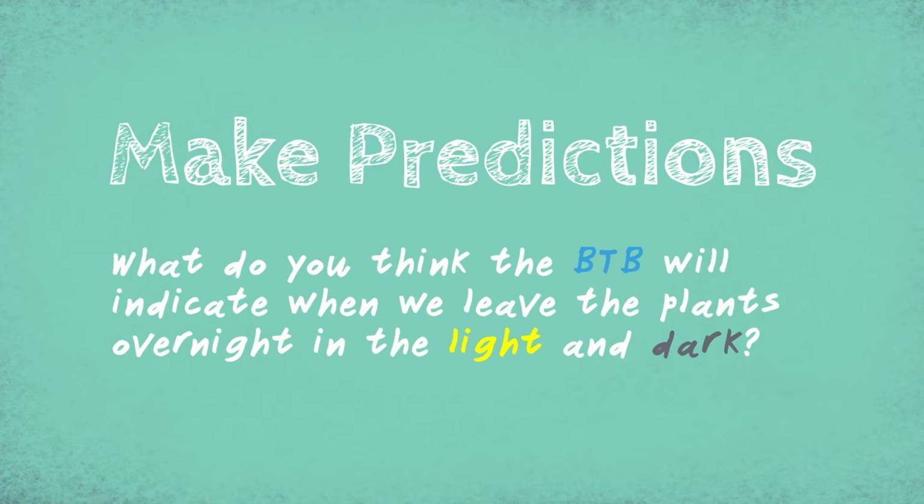What do you think the BTB will indicate when we leave the plants overnight in the light and dark? Let's pause now while you make predictions about what will happen in both the light and dark plant investigations.